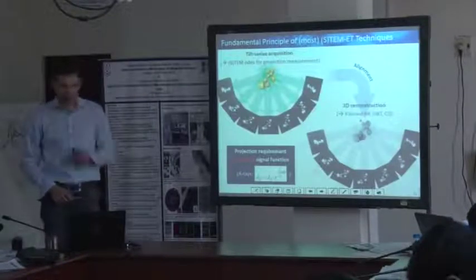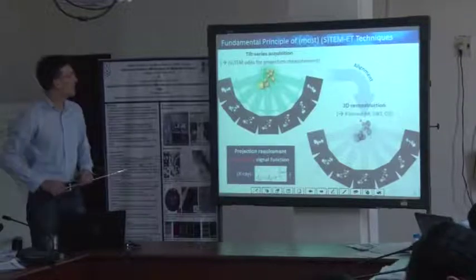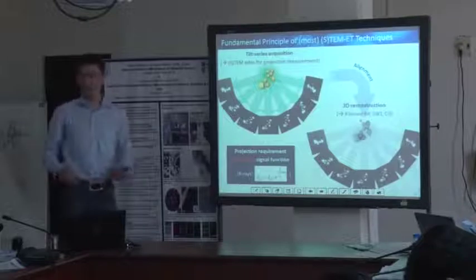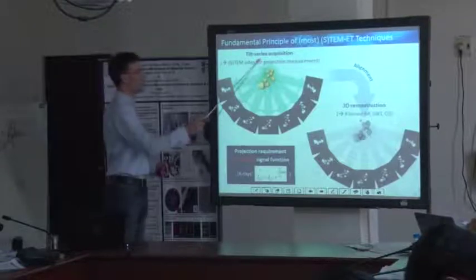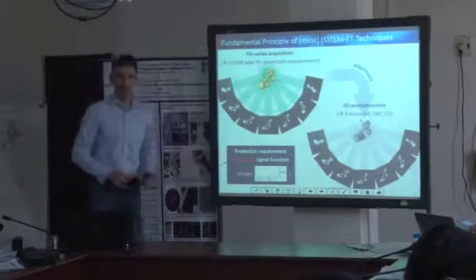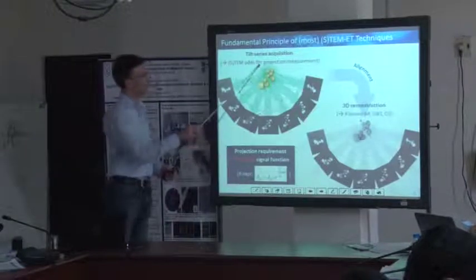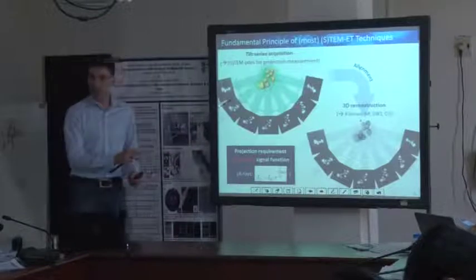Okay. So this is how TEM or STEM electron tomography works. In principle, we have two steps. First, we record images along different directions through our TEM sample.